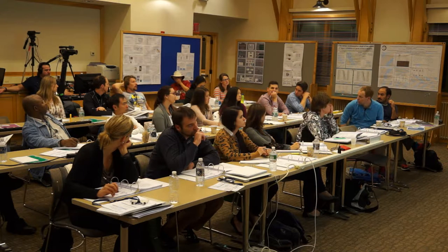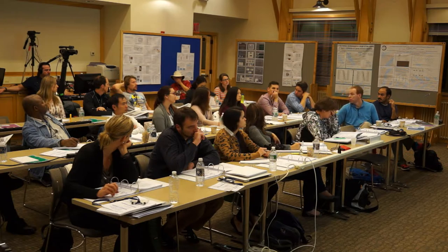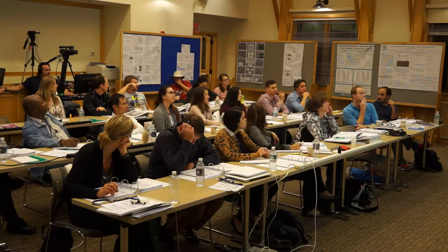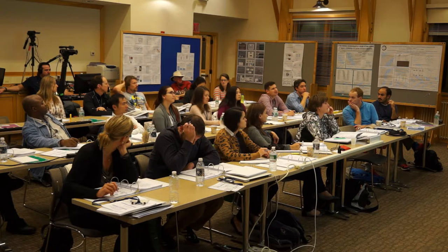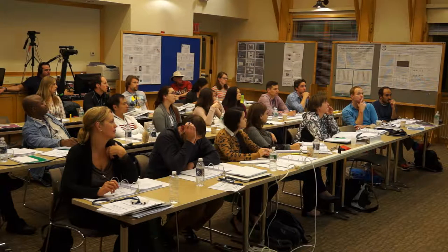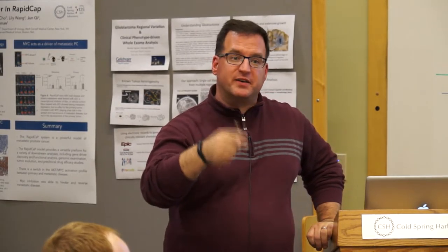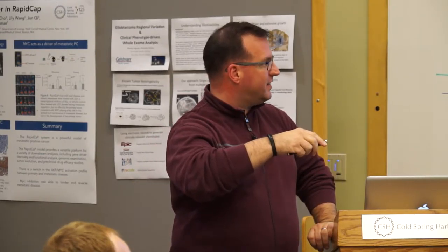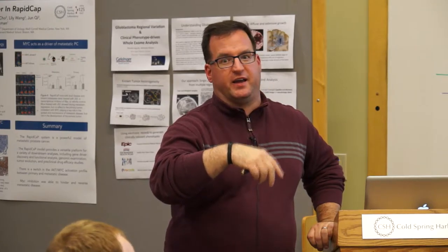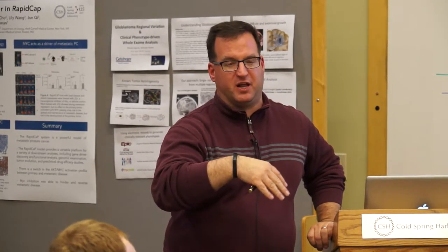How does the blocking work? Yeah. So I'll be honest, I don't remember the enzymology. Next year I'll put that up there on the slide too. But yeah. So there, the in-between arrow, this little arrow here, there's an unblocking. There's a washout, there's an unblocking, there's a fix-up step, and then it goes on, right?